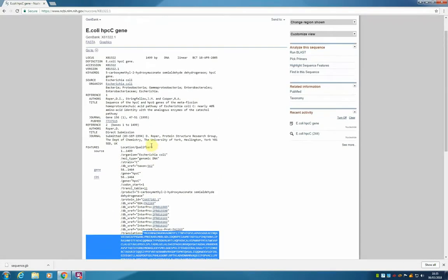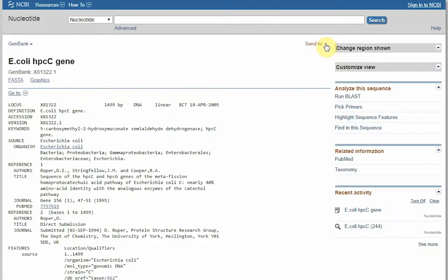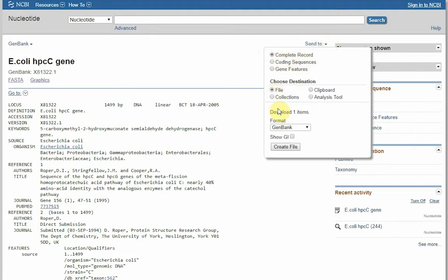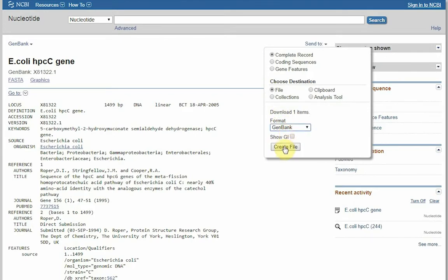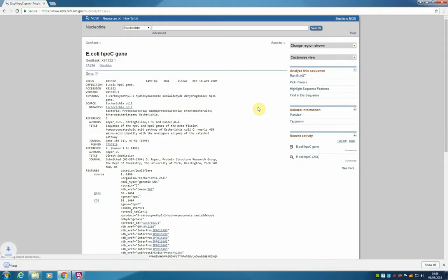We are now going to download this entry into a file, and for this we go to the send to drop down menu, we are going to leave complete record, we are going to choose file, and leave gene bank as the format, and then click on create file.